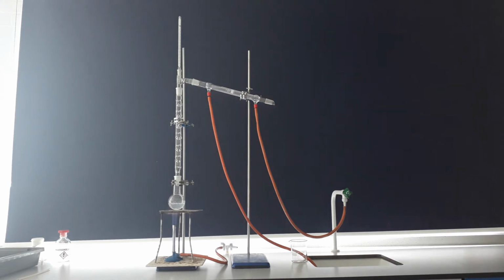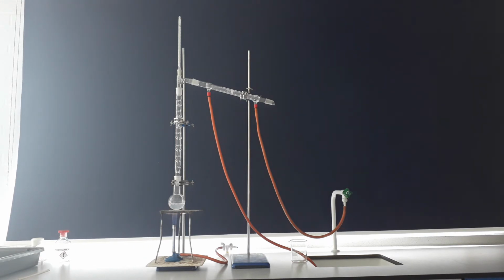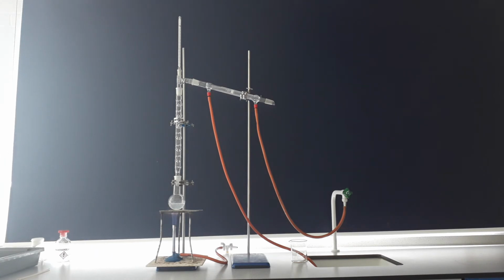through it. As the substances are heated, the one with the lower boiling point, in this case the ethanol, will evaporate. As it evaporates, the particles will go up the fractionating column. When they have enough energy, they will reach the top and the gas particles will go down the condenser. As they go down the condenser, the cold water around the outside will cool it down. As it cools it down, it will turn it back into a liquid and the ethanol will drip out the bottom. Now this separates just two substances.